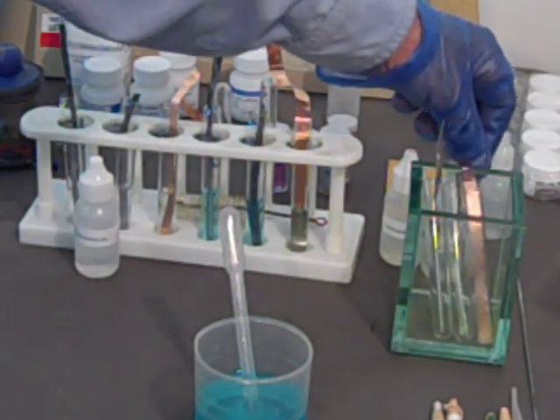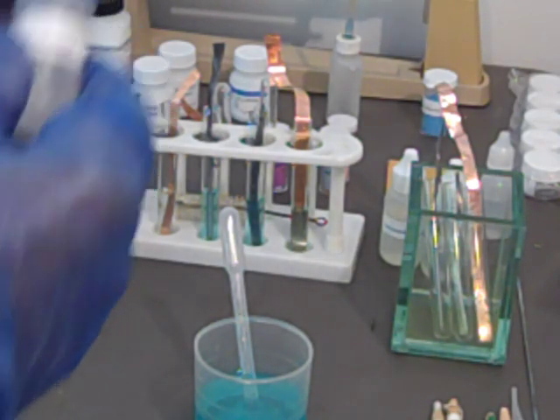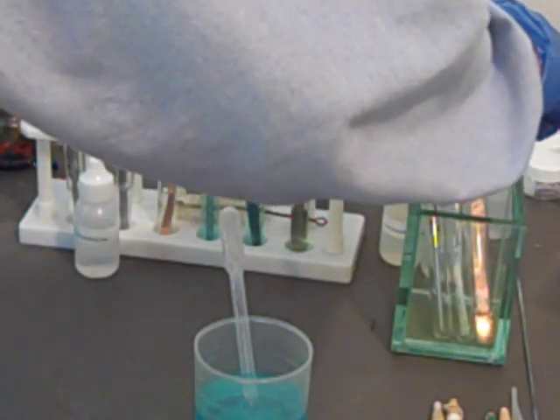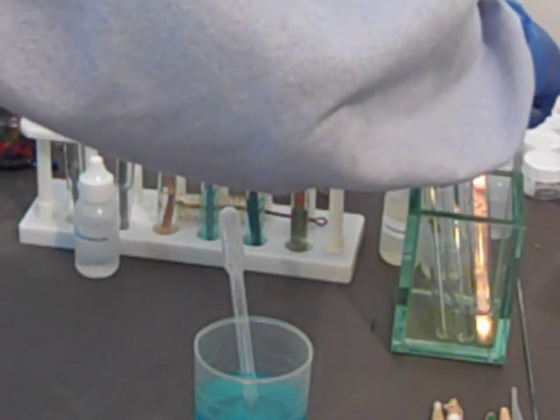Ooh, we don't have any more test tube rack. And we're going to try the zinc chloride solution in those three. So easy squeezing from these little bottles. We're only getting about 1.5 milliliters for this run.